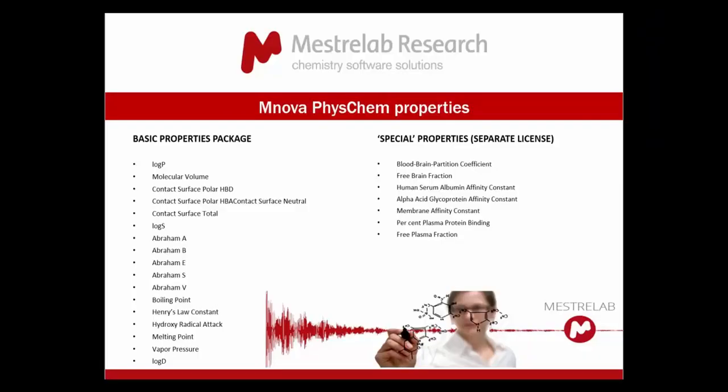Hello and welcome. I'm going to show you how to use the MNOVA PhysChem plugin. It's a short clip that shows you how to predict the physico-chemical properties of your structures.